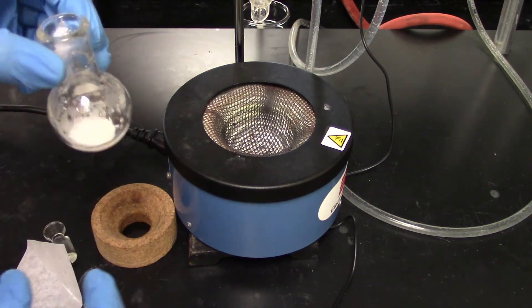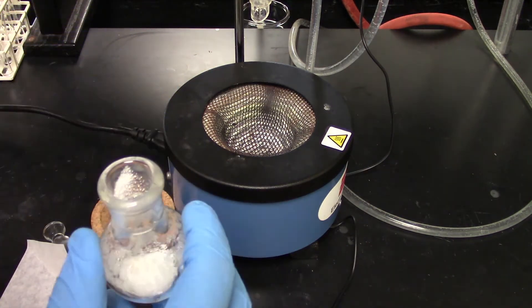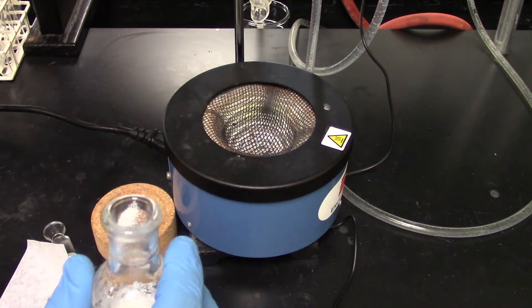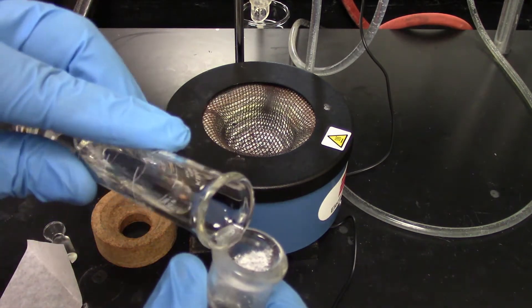Let's get that a good little swirl, and the other thing we're going to do is add a little bit of toluene, especially to wash off the walls there.